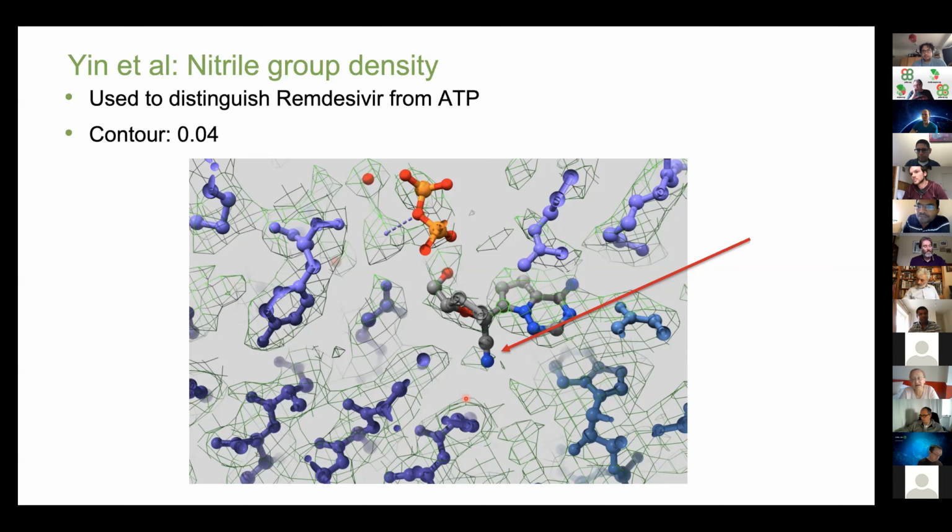The majority of people who are doing high resolution maps do that by pressing the button. They never even look. At this level, RELION and cryoSPARC do provide distribution of angles, but people do not think about what they're looking at. They do not understand what's going on. They do not understand there was a problem. And it was not only once, with one map, that we suffered from these troubles.